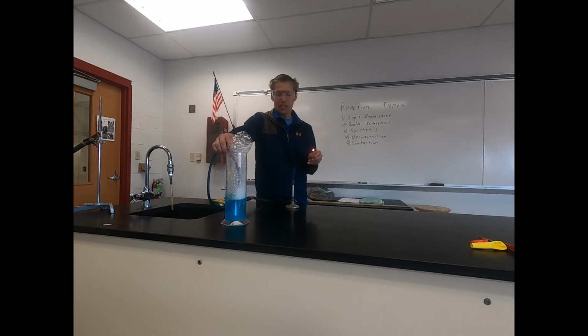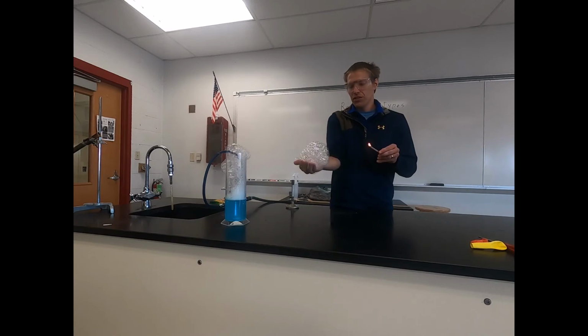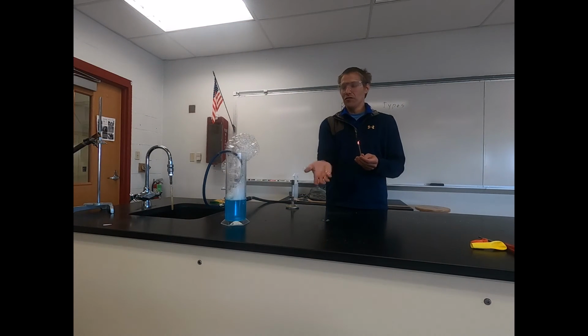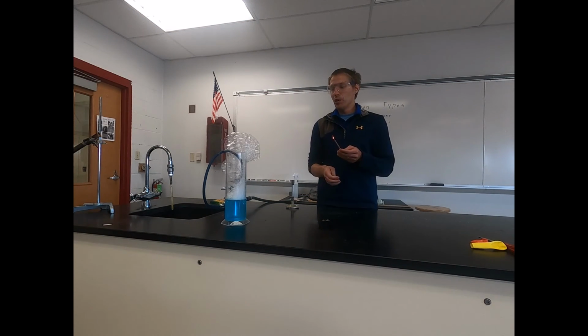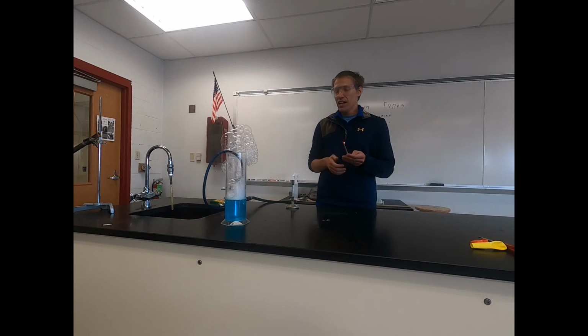and with those bubbles, as we create those bubbles, we'll pull off a chunk of those bubbles, and these bubbles contain methane. The gas released by this jet is methane. So we'll take just a scoop of that gas, I hold it on my hand, I bring a wooden splint to it, and it causes a reaction. So in that case, the burning of that gas is a combustion reaction. It's reacting with the oxygen in the air and causing a combustion reaction.